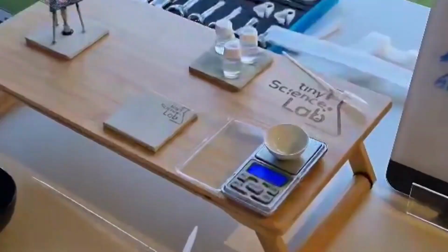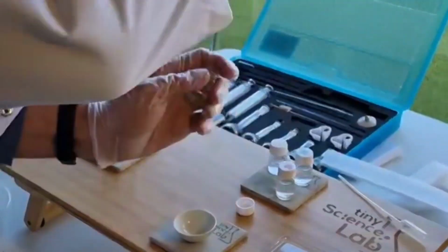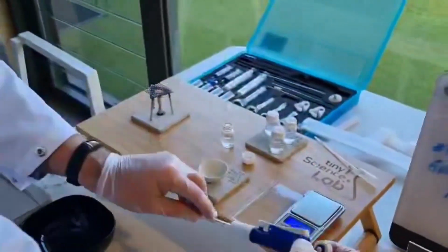So let's have a look at Kingsley. So firstly, we'll weigh it empty, all right, 10.86, and now we'll add some of our sample. So let's do Kingsley Beach.